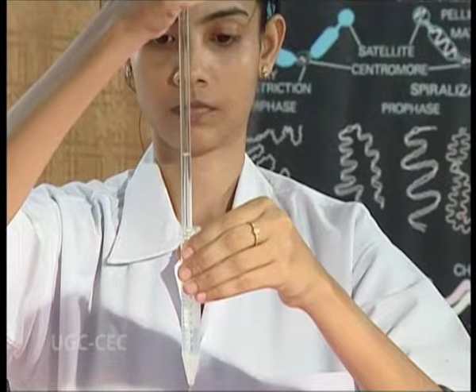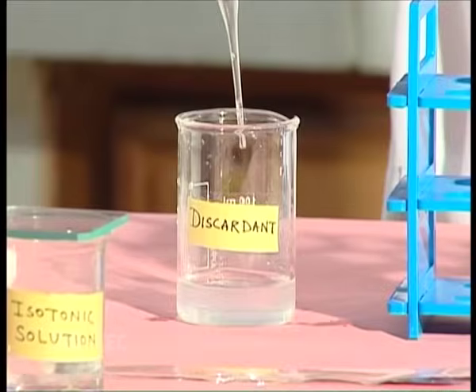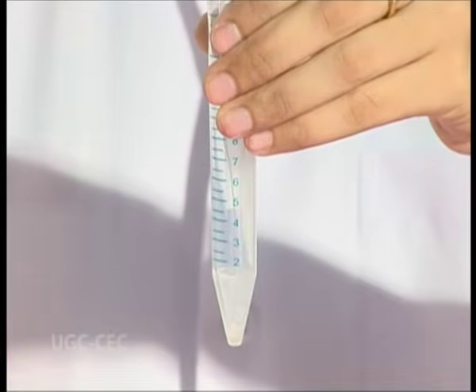Remove the supernatant carefully using a Pasteur pipette without disturbing the pellet.